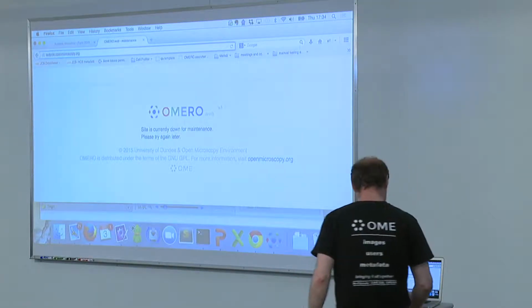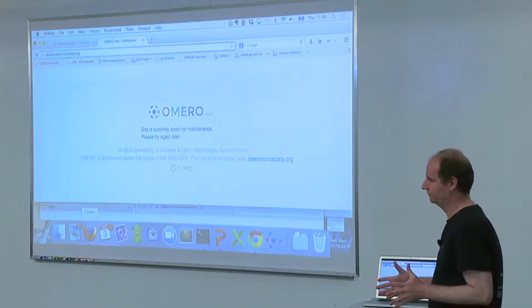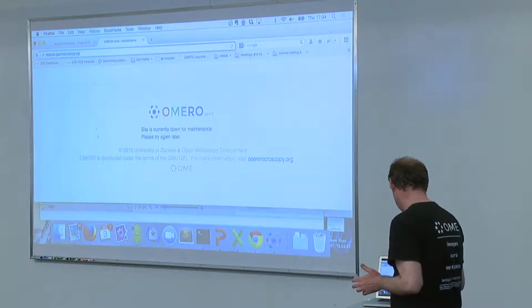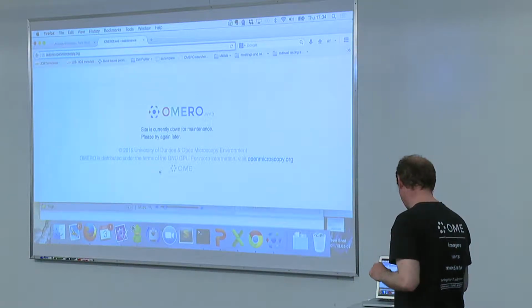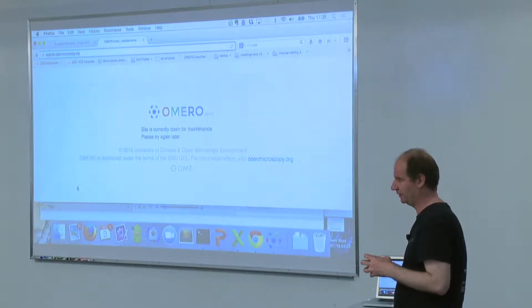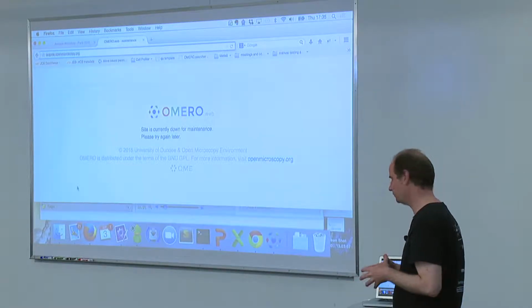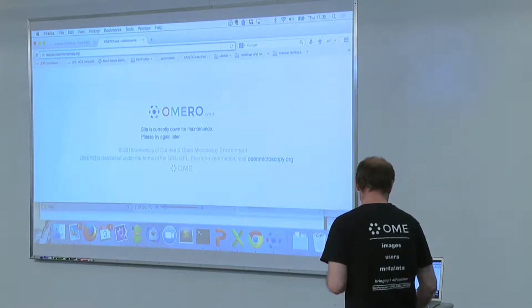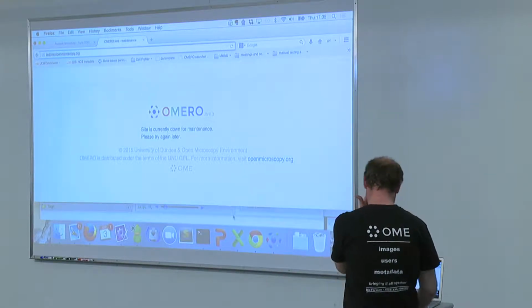Yeah. So let's go to the ImageJ workflow, and let's see what we can do if we have the OMERO for ImageJ plugin, and how we can use ImageJ as a client to connect to OMERO and work with the images on the server.